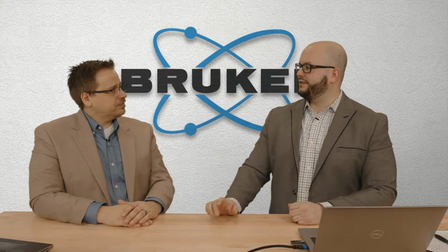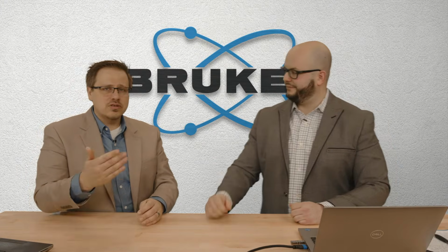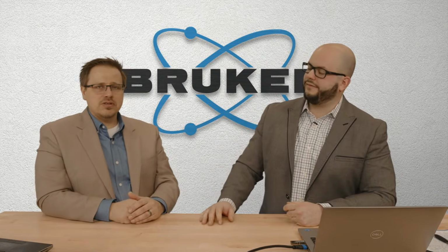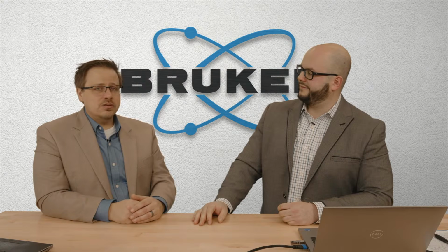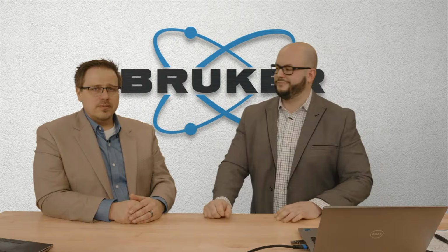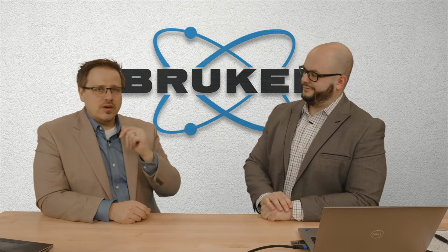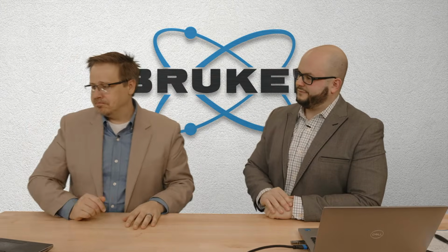I think we have a couple of 2D classes scheduled this year. Yeah, here in probably Madison, and then there are also some in Karlsruhe and some of our other application labs internationally. But I do have to say, the digital training has really been something that people are excited about. And normally you can just get right to the problem. Yeah, and they're pretty inexpensive too.